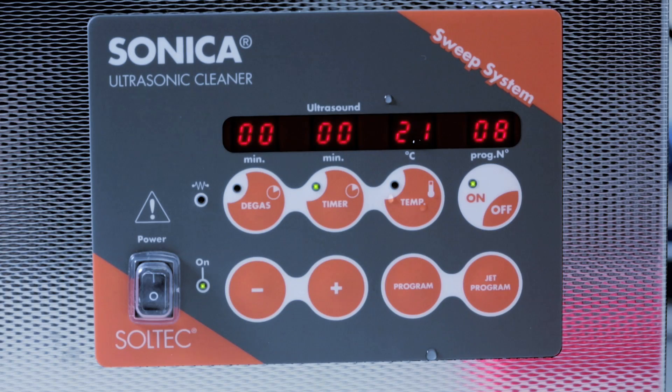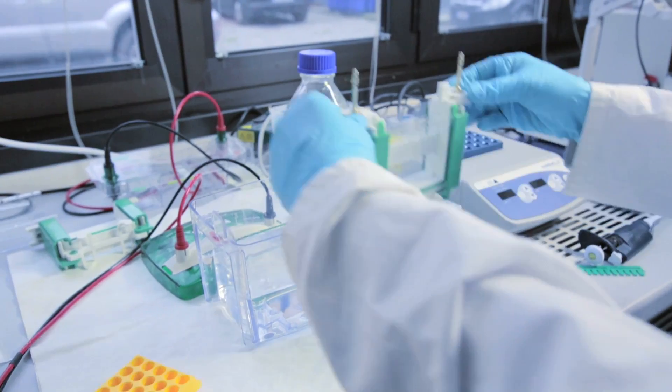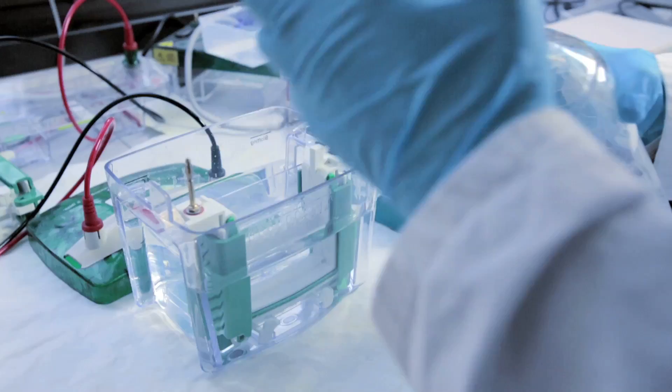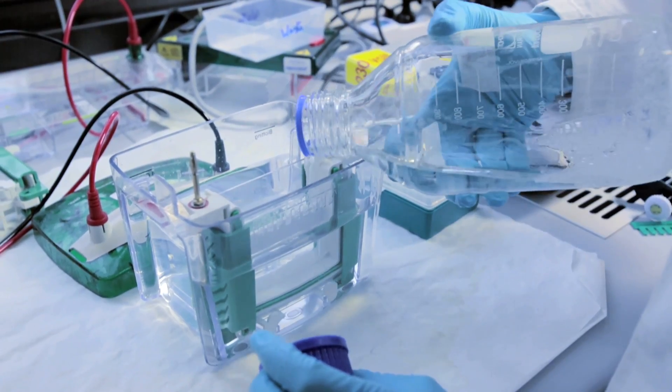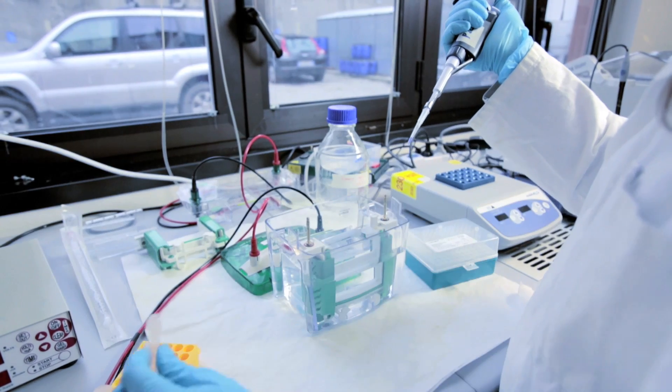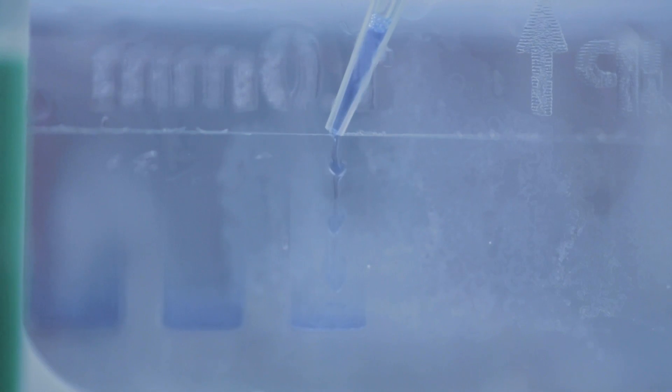In this context, the ultrasonic bath is very useful for us because we can break at the same time many different samples containing bacteria in very small volumes such as 200 microliters. Furthermore, we can also regulate the time and temperature of sonication.